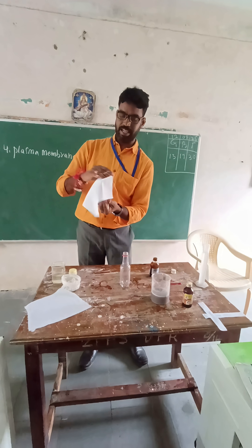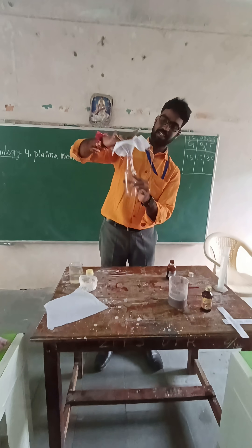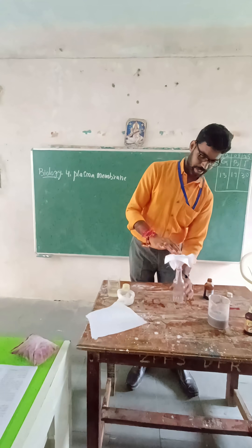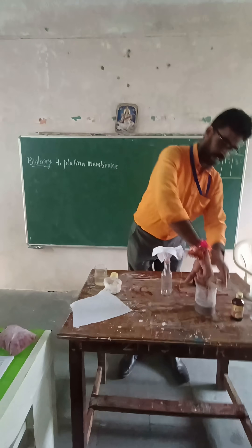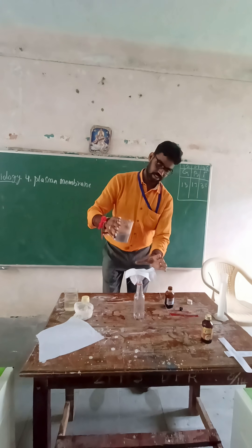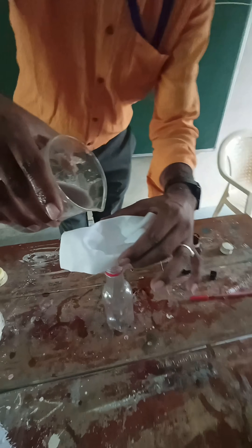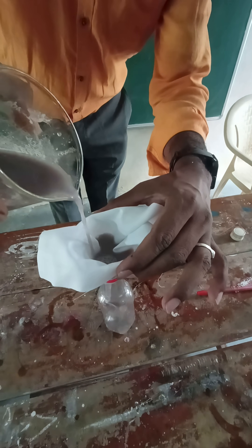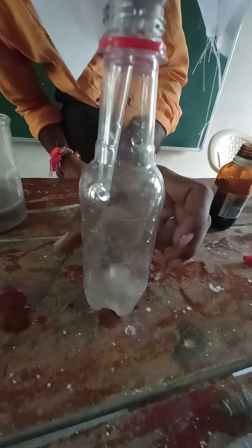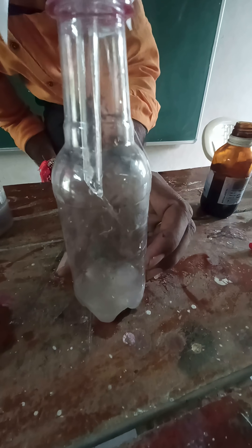We arrange the cotton cloth in the funnel. Now we pour the flour solution into the funnel to observe what happens.